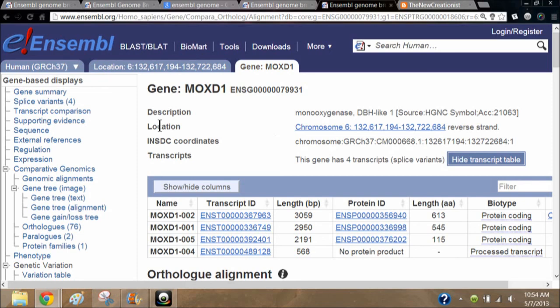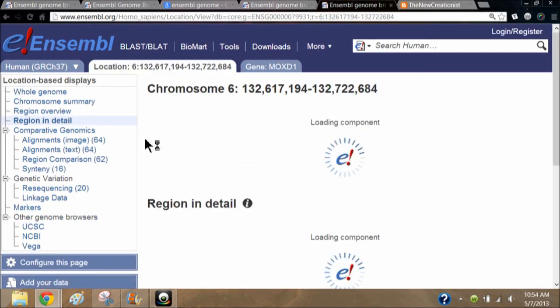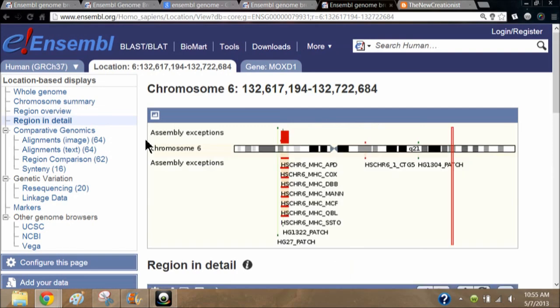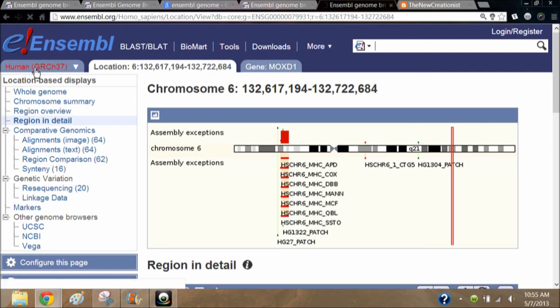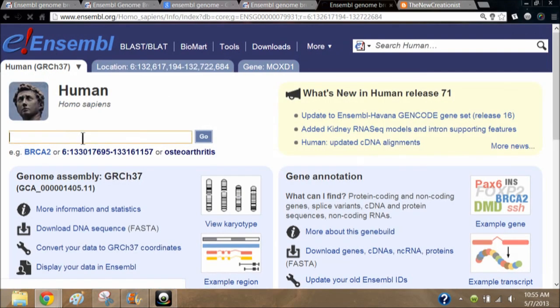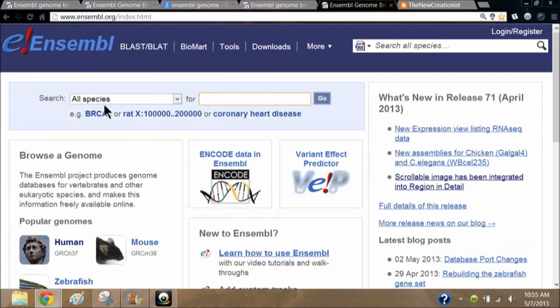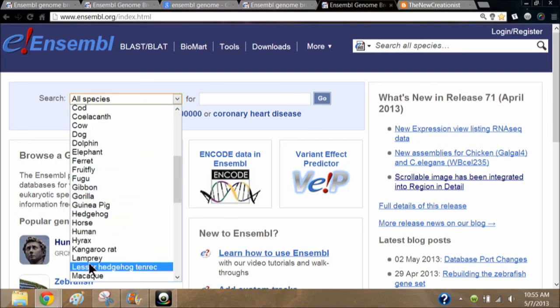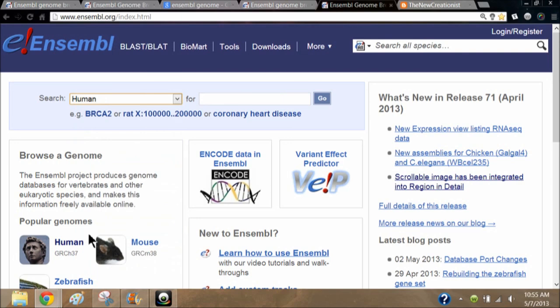So that's a pretty good start. You can pick out genes that way — once you have a list of genes you want to look at, or if you're reading a paper and somebody's talking about a specific gene, you can come here and look it up. You can put it in the search bar from the human genome page, or from the very first page you could search all species or pick a particular one. Human is usually where I start because that's where I want my query to start. That's enough for today — until next time, God bless.